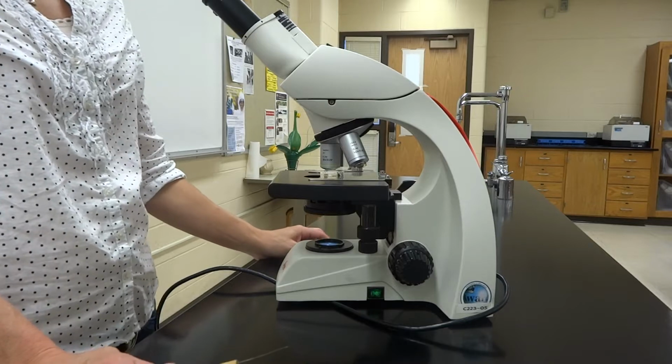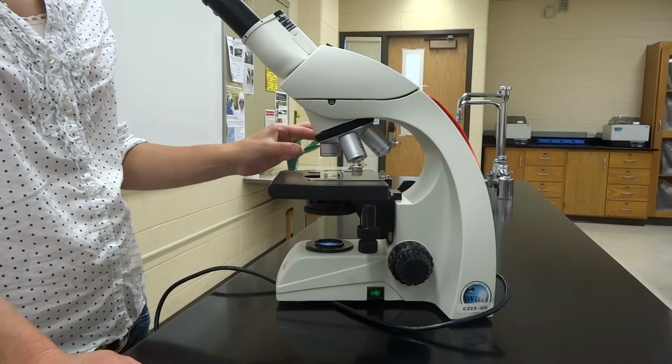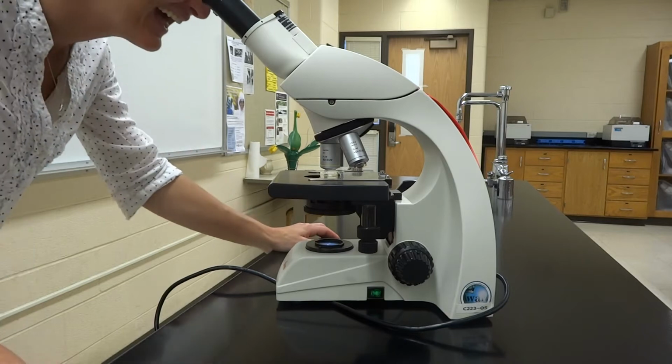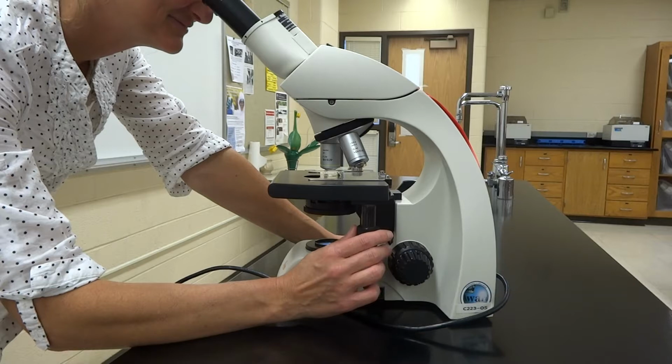These do tend to snap off if you yank on them, so we use that little nose piece at the top, just as Liz is doing for us. It'll help us out a little bit. Otherwise, we'll break our nice expensive things. So don't touch the lens or the objective when you're doing this.